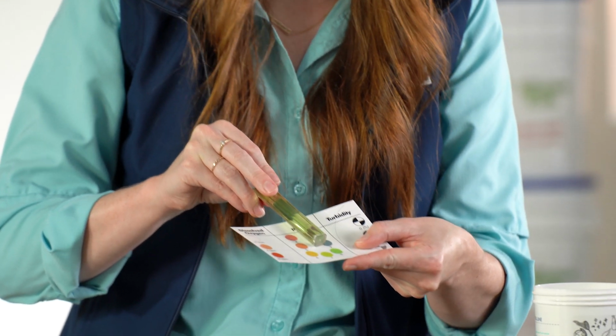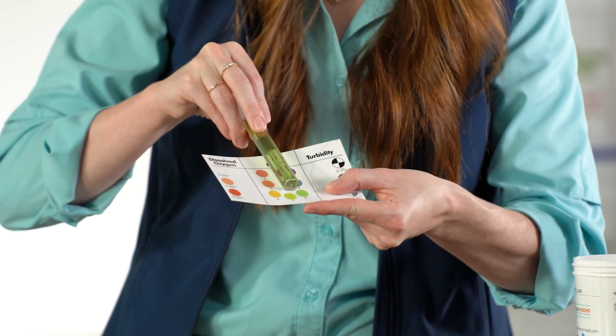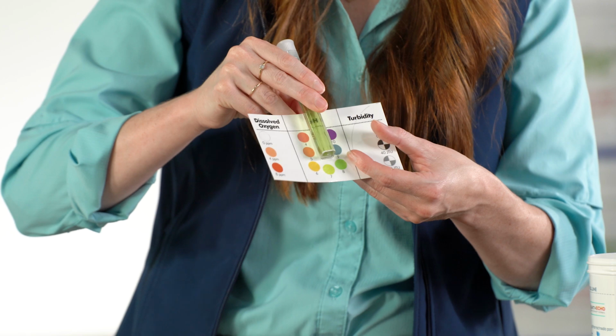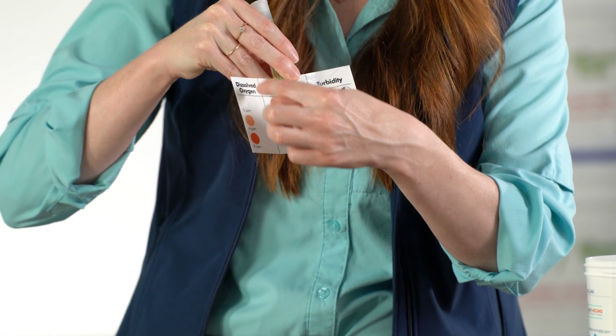Then you'll analyze the pH test tube in the same way. Place it on the center of your comparison card where your pH values are, making sure you hold it on the white background. Decide which color is closest to your pH measurement. Record that on your data sheet. Remember, discuss and decide together.